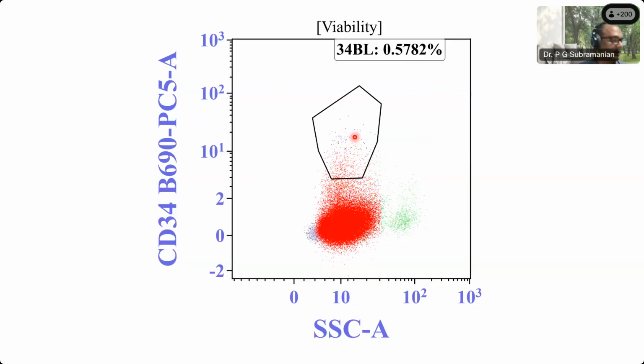Next, Karan, can you take this? Sure. This plot is showing, again, the viability gate. Yeah, Karan, go ahead.